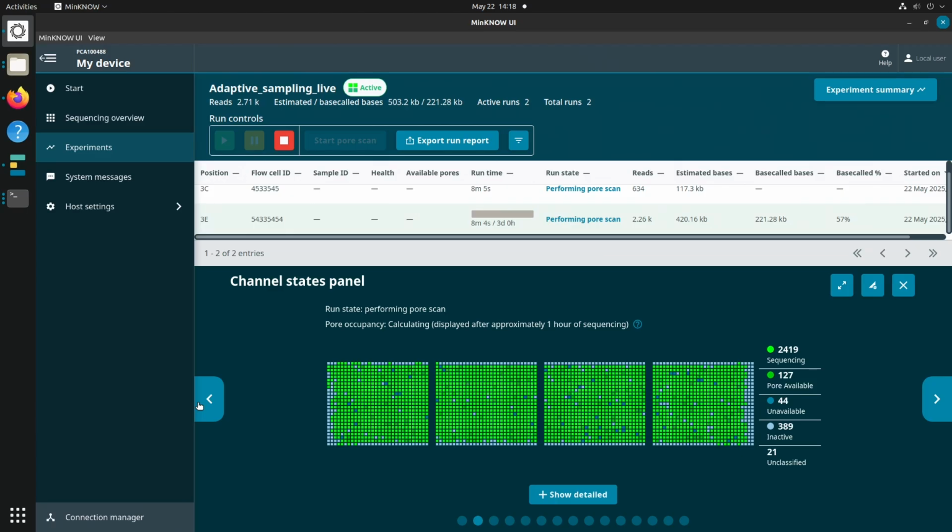Of course, it also gives you SNV phase blocks. And the visualization of the mapped reads and the different tracks can be done either within Epi2me or on your favorite genome viewer.